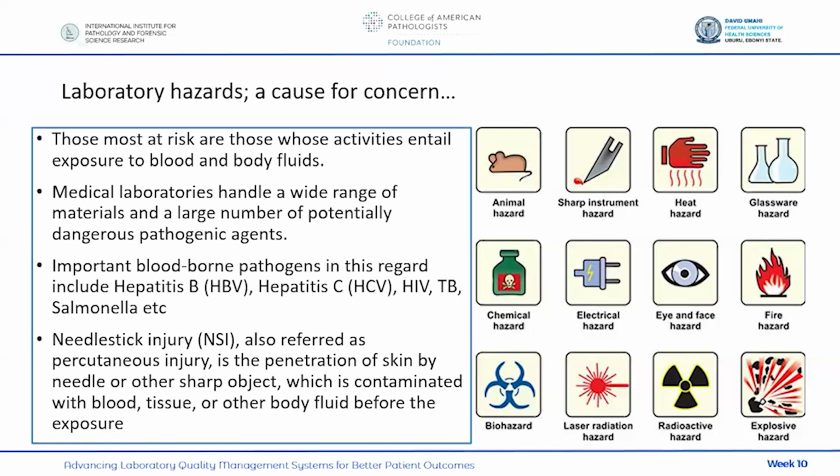I want to call our attention to this, that when we talk about needle stick injury, it's not only penetration by needle, because a lot of times our mind only goes to needle and we think about people who use needles, who give injections, okay? And then we forget that, yes, in the lab we use needles, but not all the sections use needles. But we're also exposed to other sharp objects, which can also cause this needle stick injury. And so when injury is caused by way of penetration of skin, whether it's by needle or other sharp objects, it is also referred to as needle stick injury. And that object has to be contaminated with blood, tissue, or other body fluid before the exposure.